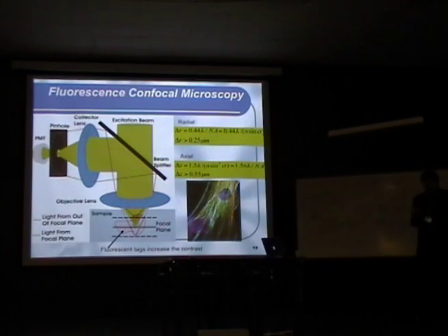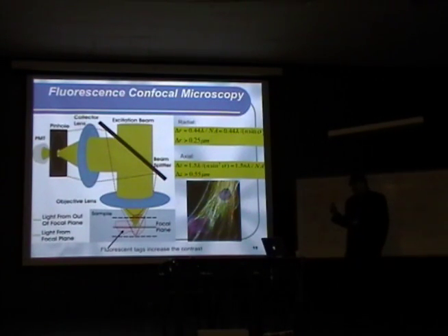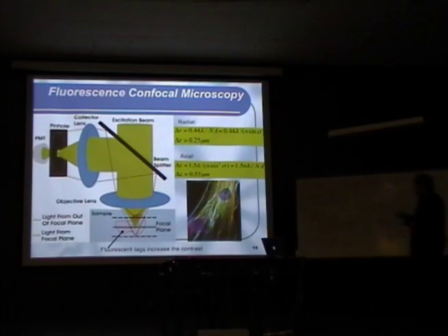The resolution in the optical microscope, which tells us how well we can resolve different features in the lateral plane and in the axial plane of the sample, is shown in here for confocal microscopy. So it's comparable to the resolution of the regular optical microscope in the lateral plane, although it's a little bit better, due to the reason that in here we use laser excitation, and it can be as good as 250 nanometers if we use, for example, blue excitation light.